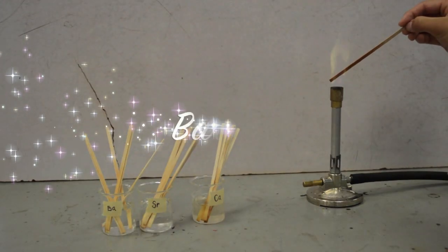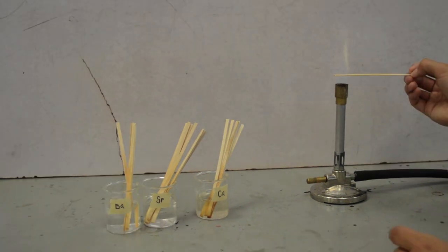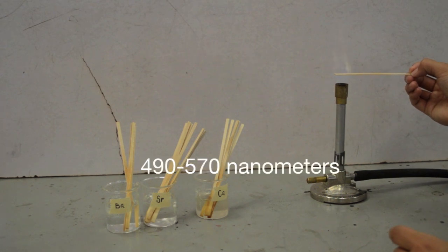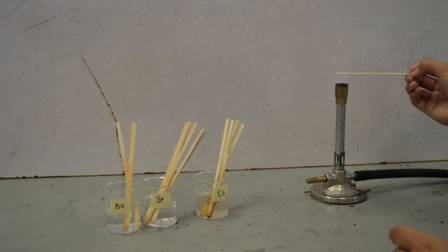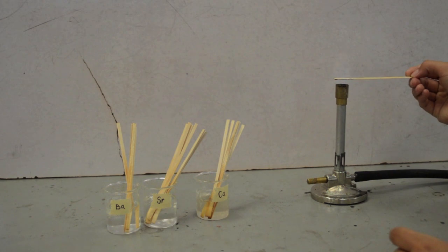The last metal is barium. Although the color of the flame is hard to see, barium emits a green-colored light. The color green has a wavelength of 490 to 570 nanometers. Although we did not test magnesium, which is another alkaline earth metal, this metal produces a white-colored flame.